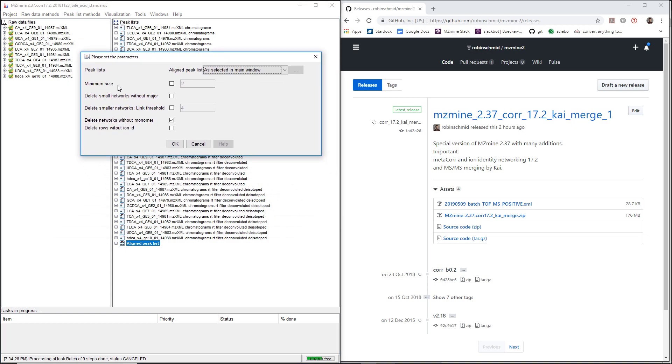With this, you just have the minimum size. I often tend to just go for the minimum size of three.